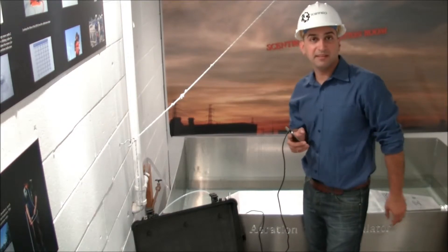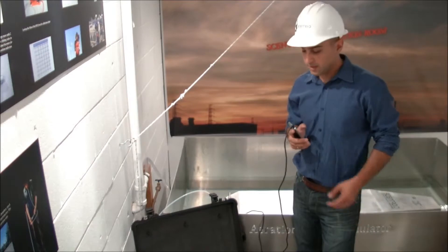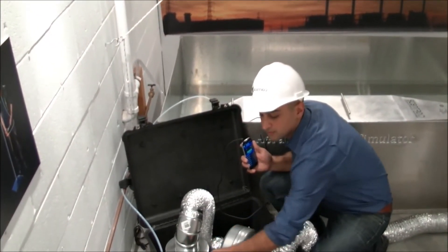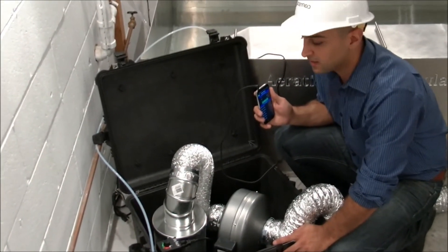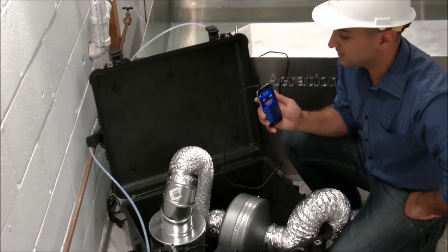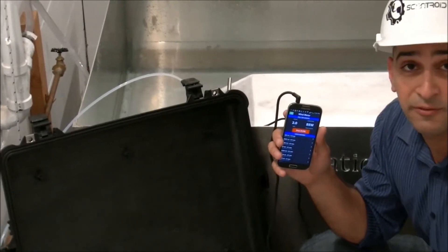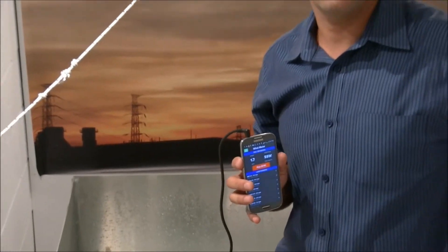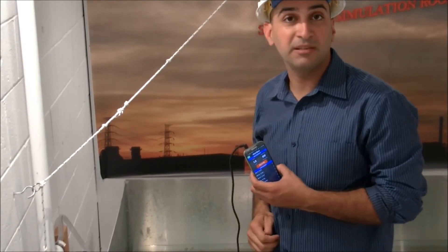Now that we have everything connected, I can tell you about another unique feature. With the variable speed controller, I can decrease or increase the speed of the air being supplied to the wind tunnel. What's really interesting is I can monitor that speed on my smartphone — and that's not a calculated speed, that's the actual speed as measured within the wind meter itself.